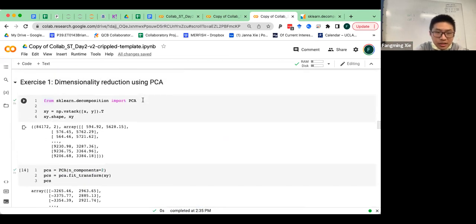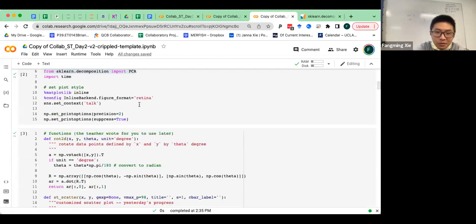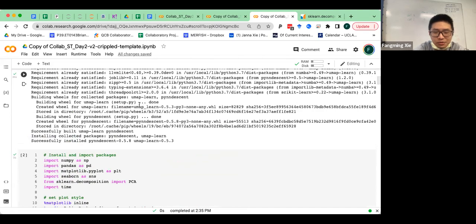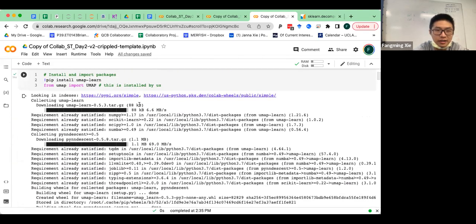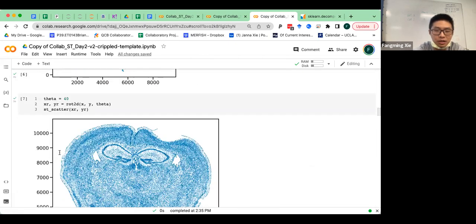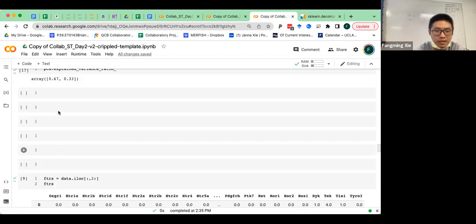The next thing we talked about is UMAP. So UMAP is, application-wise, very similar. It's also a package people wrote about. You just need to learn how to use it. So in this, I already import from UMAP, import UMAP, capital UMAP. So I'll just paste it down here.